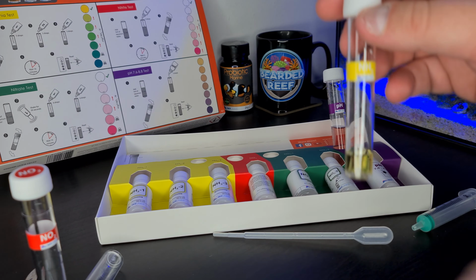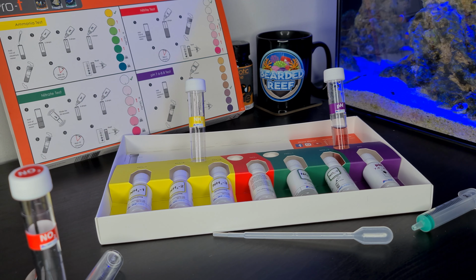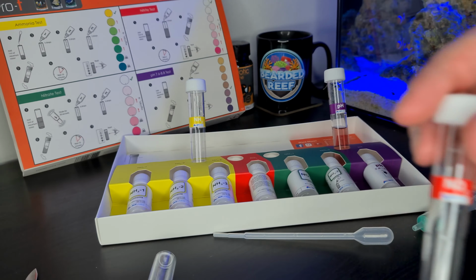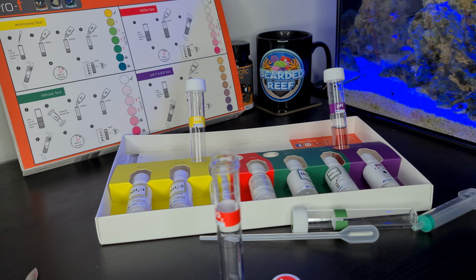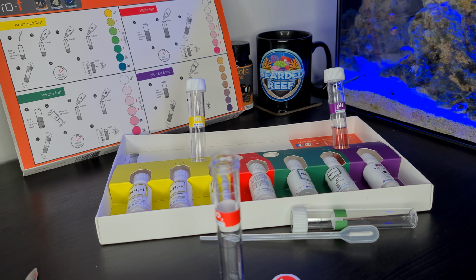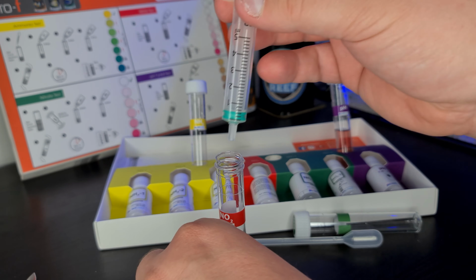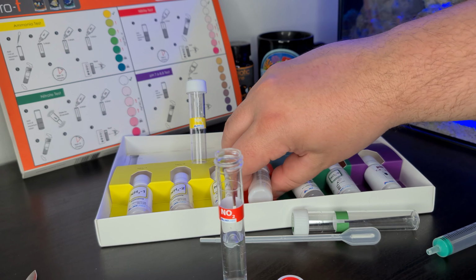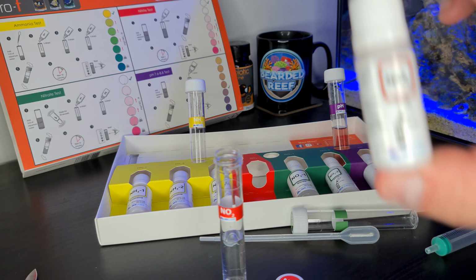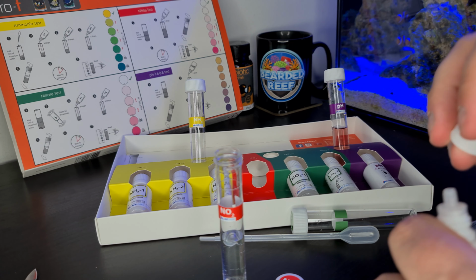So that's the ammonia test done anyway. Again, not the worst. It does take a bit longer than other tests, but overall not too bad a test actually. So I'll go ahead and do the nitrite test now. Again, I've already got stickers on this. So it says add 5 mL of aquarium water, so I'll do that. Five mil in there. Then it says add 5 drops of this solution here. So we'll give this a shake. And then we'll add 5 drops in here.